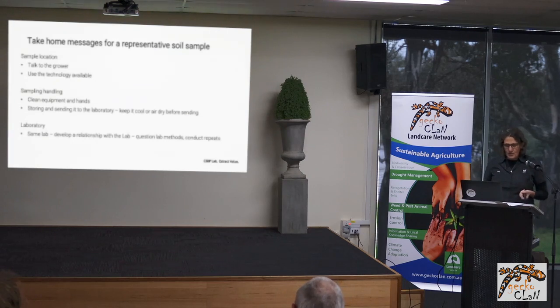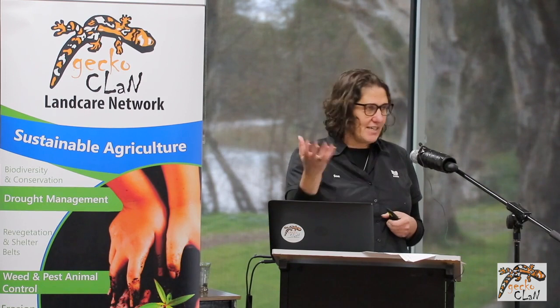And I get questions lately about handling, like should I keep my sample cool, or should I air dry it before I send it, or should I dry it and so forth. I'm getting a lot of questions about that of late. So you either keep it cool, air dry it, or dry it really quick before you send it to the lab. You've got three options. I've asked the senior chemist, and they just impact your nitrogen and your carbon results really.